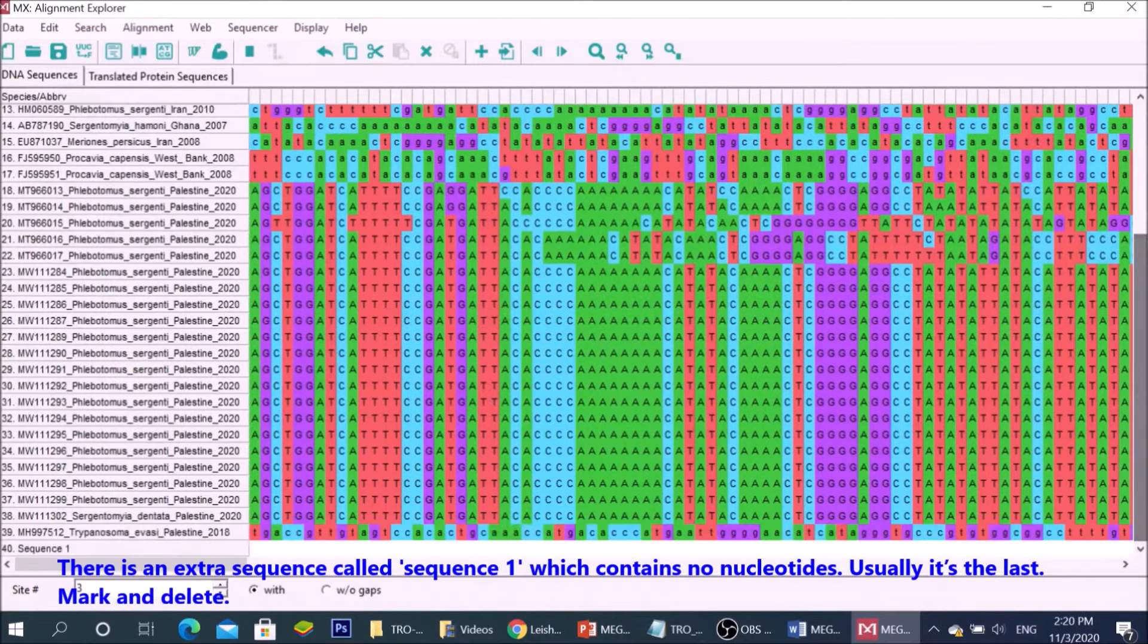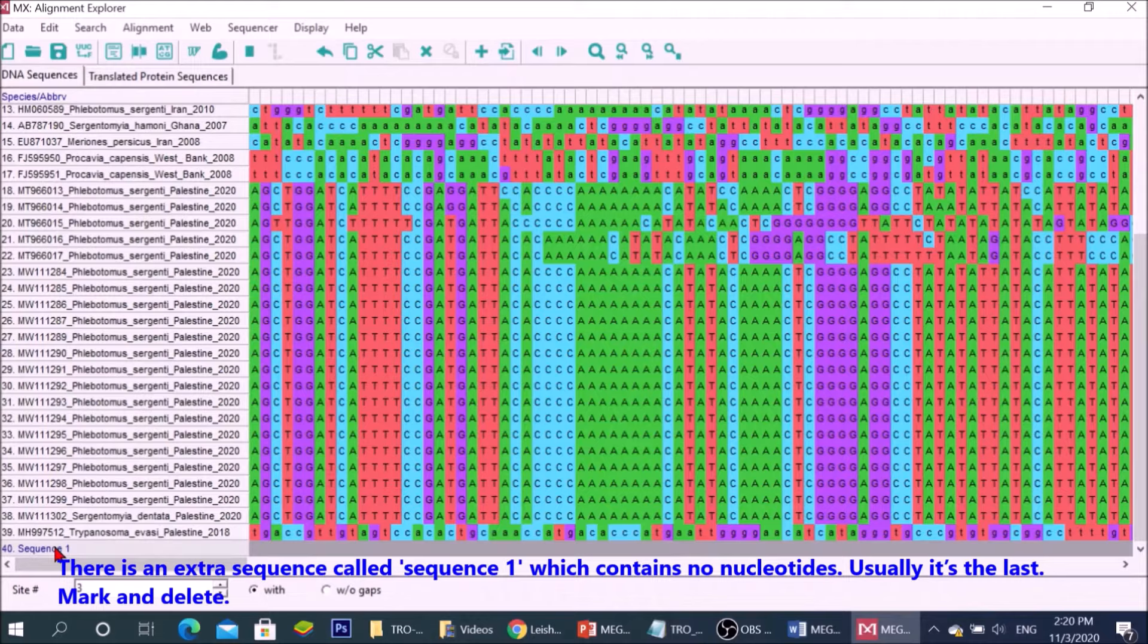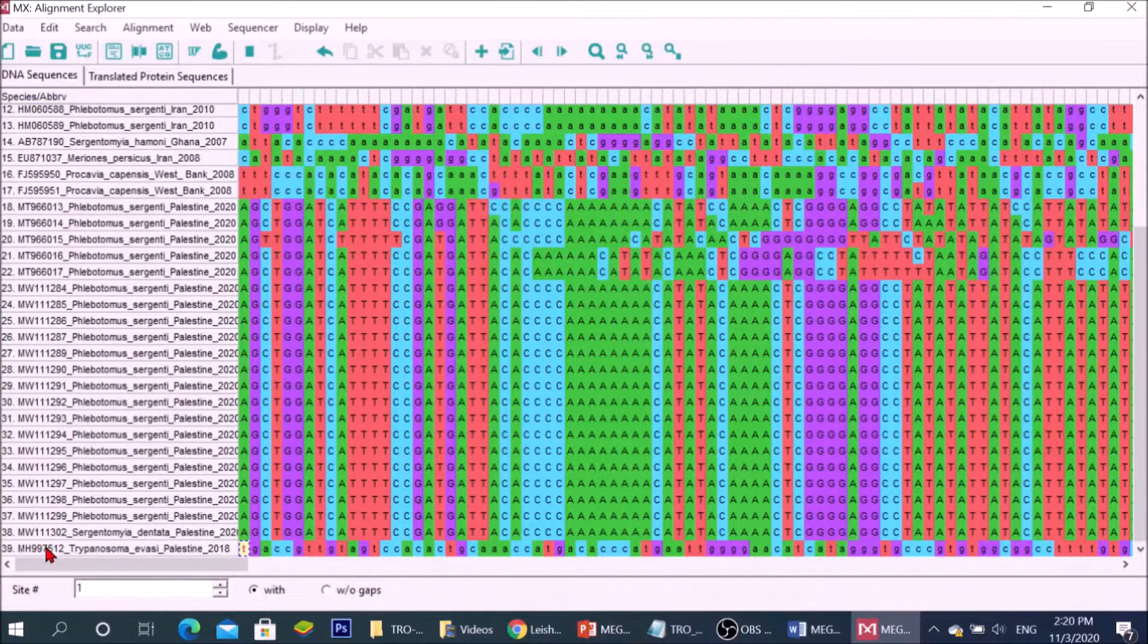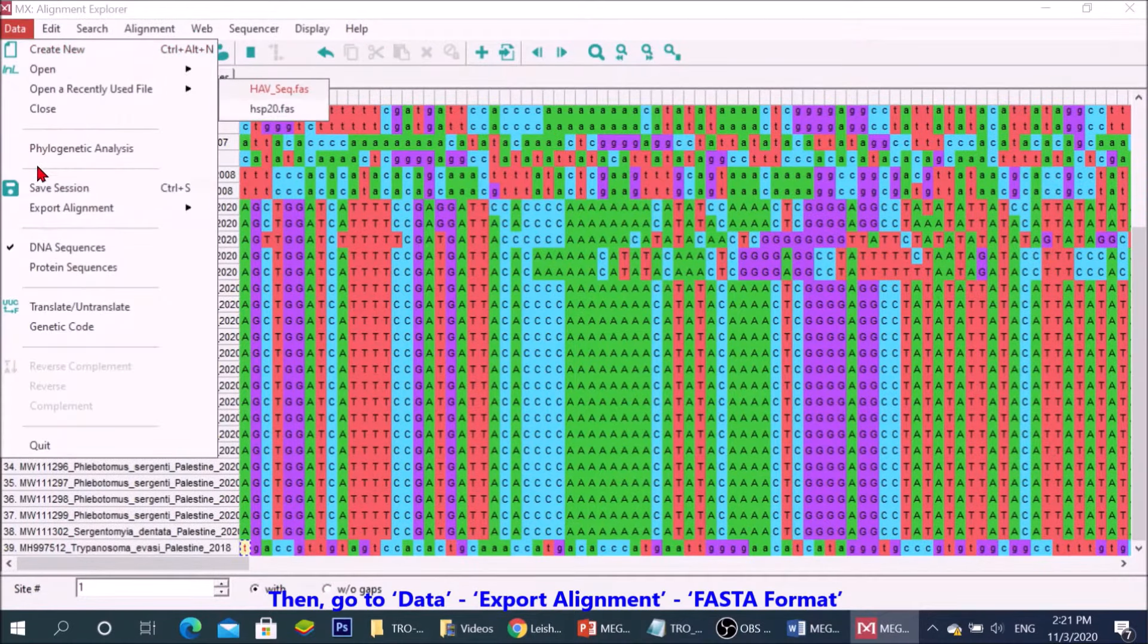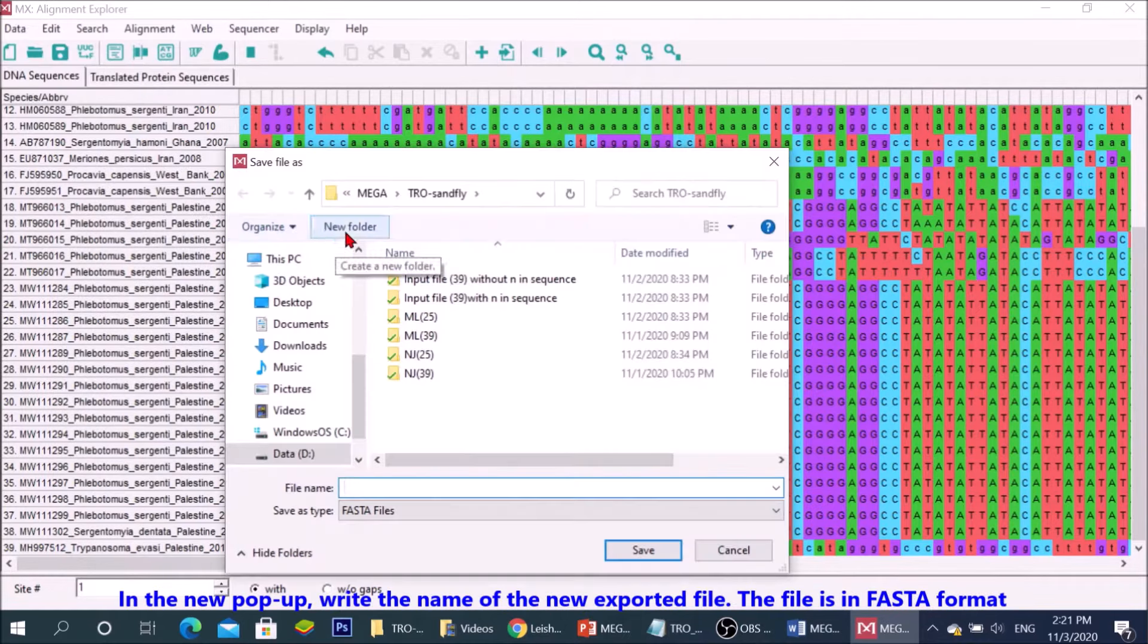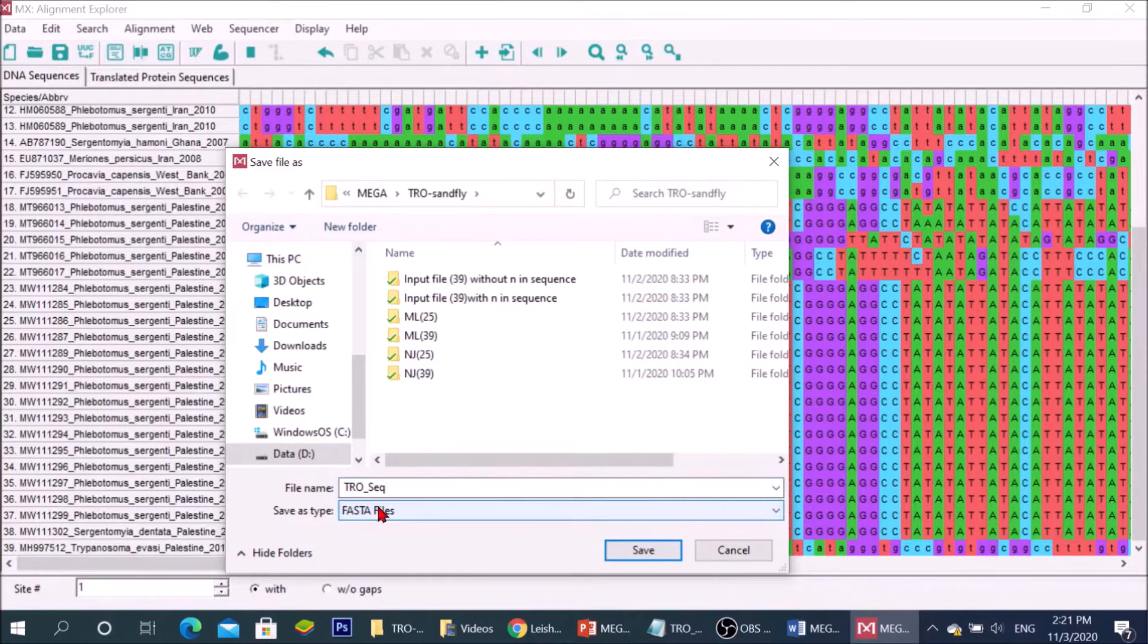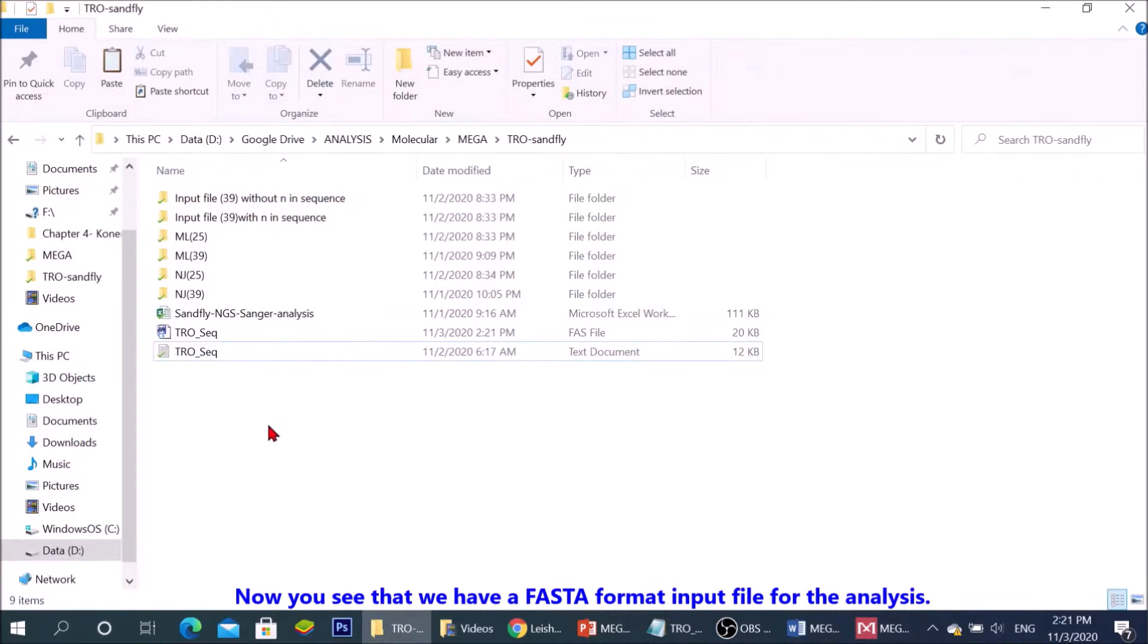There is an extra sequence called sequence 1, which contains no nucleotides. Usually, it's the last. Mark and delete. Then, go to data and export alignment to FASTA format. In the new popup, write the name of the new exported file. The file is in FASTA format.